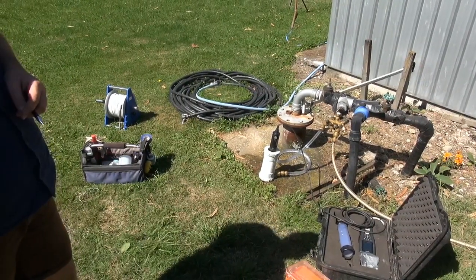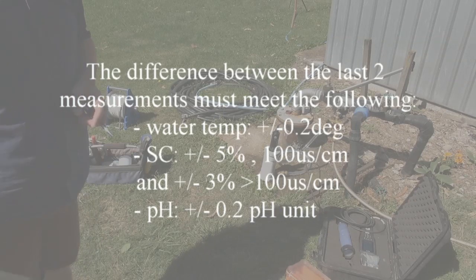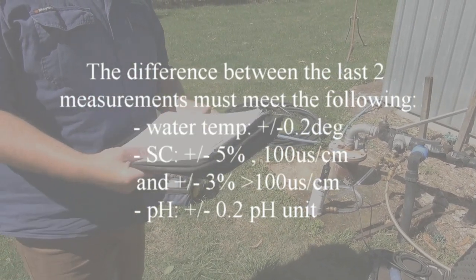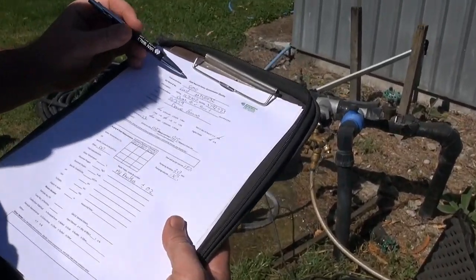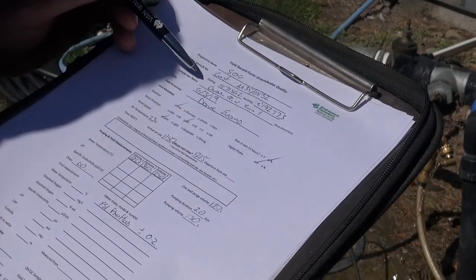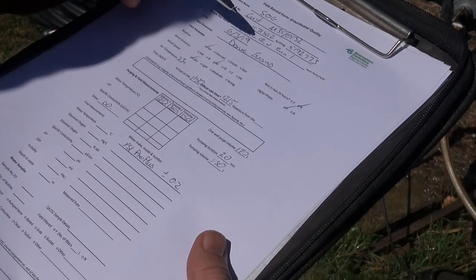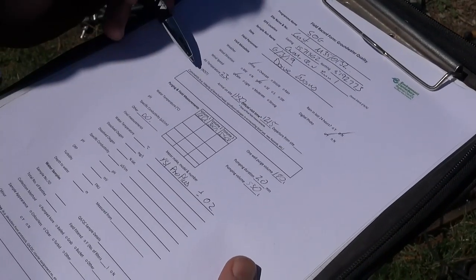With that in mind, this well will be purged in 20 minutes. The field parameters have now stabilised, so from here we can go ahead and collect our field parameters and fill up our bottles. We run through the details of the programme and the site and the sampler: location, date, name, weather information — hasn't rained, north-east breeze, taking a digital photo, wind speed calm, temperature 23 degrees, etc.